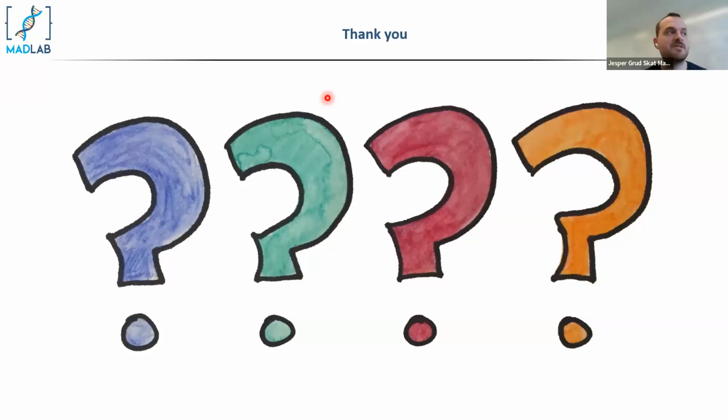Yes, that's a good question. The prediction of dead cells is only possible in single cell RNA sequencing currently, because we use mitochondrial content to softly label the cells initially, and you cannot do that in single nucleus RNA sequencing. So it doesn't work. Okay, thank you so much.